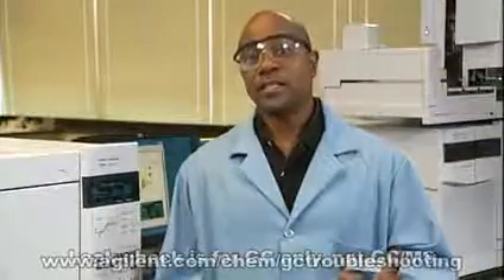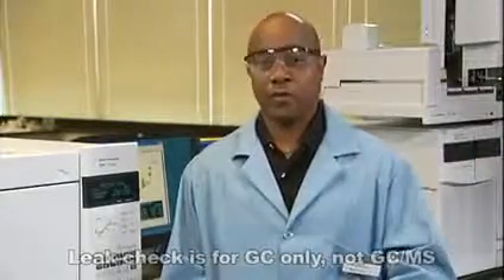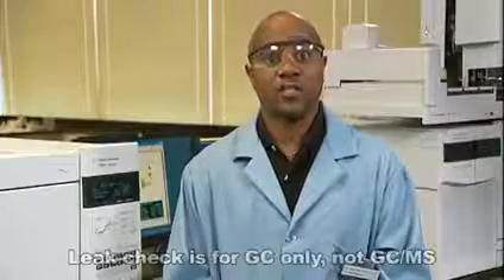I'm going to walk you through a simple inlet leak check. It can help you catch a leak from a loose fitting or bad seal — things that happen when you install a column or replace a liner, or after the first few temperature cycles of the oven.